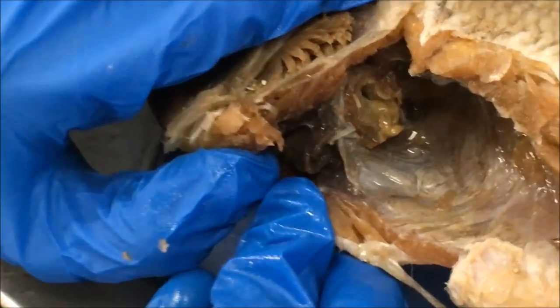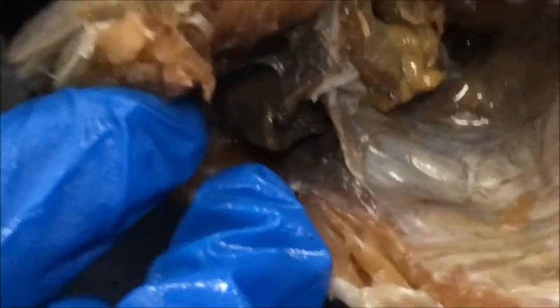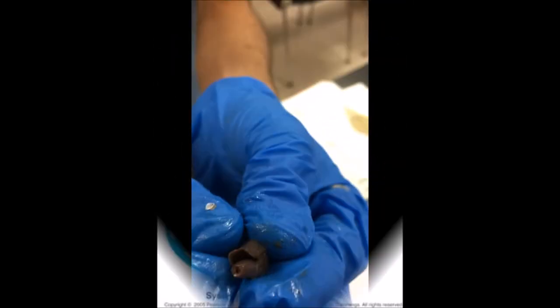This is the heart, which is found behind the pericardial cavity. The heart is two-chambered, made up of a ventricle and an atrium. Blood is pumped out of the ventricle to be oxygenated by the gills, and this blood then goes on to nourish the rest of the body. The cycle continues after deoxygenated blood returns to the heart.